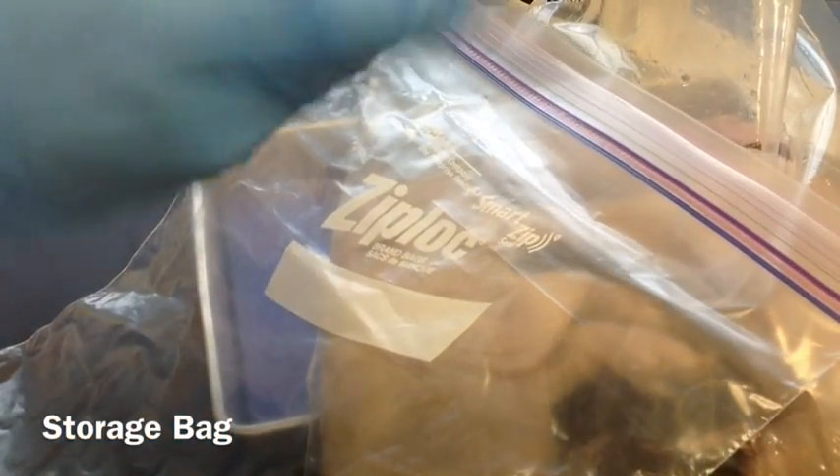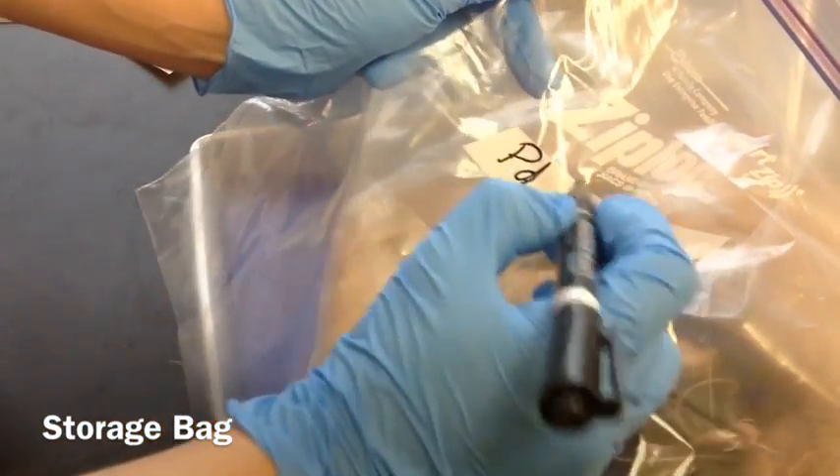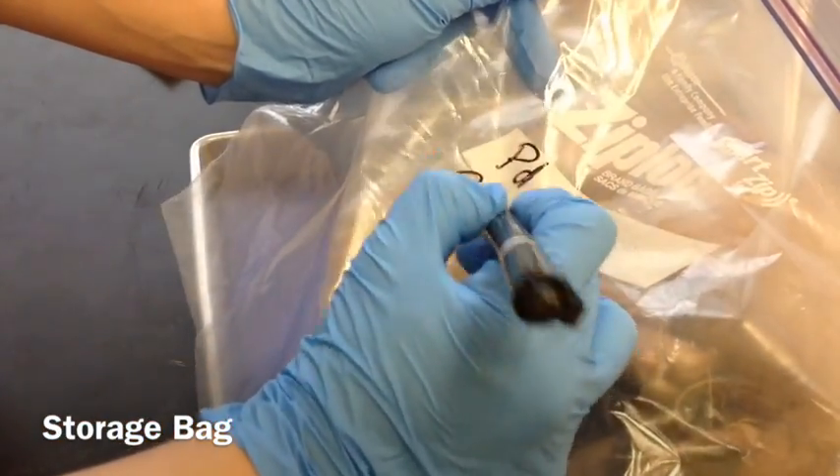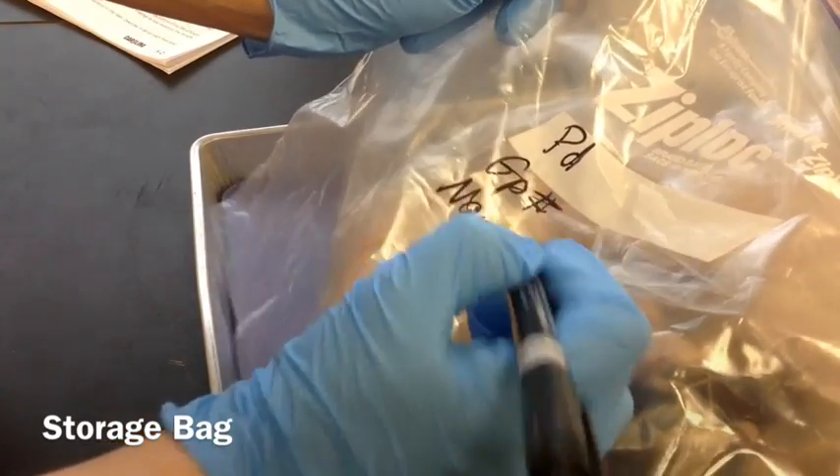You're also going to need a ziplock bag and a label. Label it with your class period, your group number, and your name if you want to write your name on it.